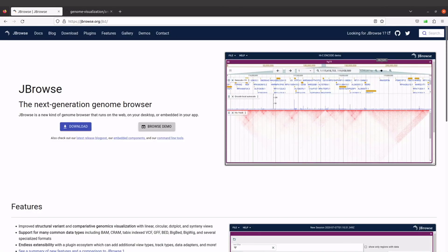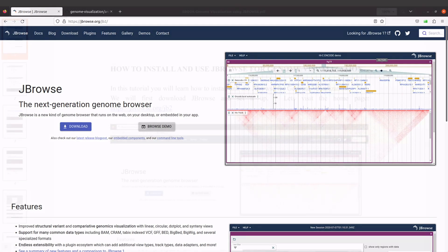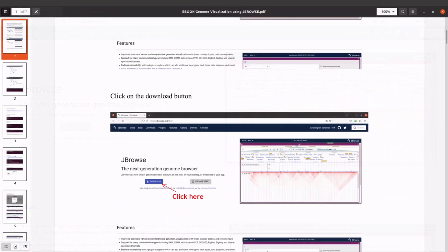Hi everyone, in today's tutorial I am going to show you how you can install, setup and use JBrowse. JBrowse is a tool that is used for visualizing genomes, so you can use it to visualize genome annotations.